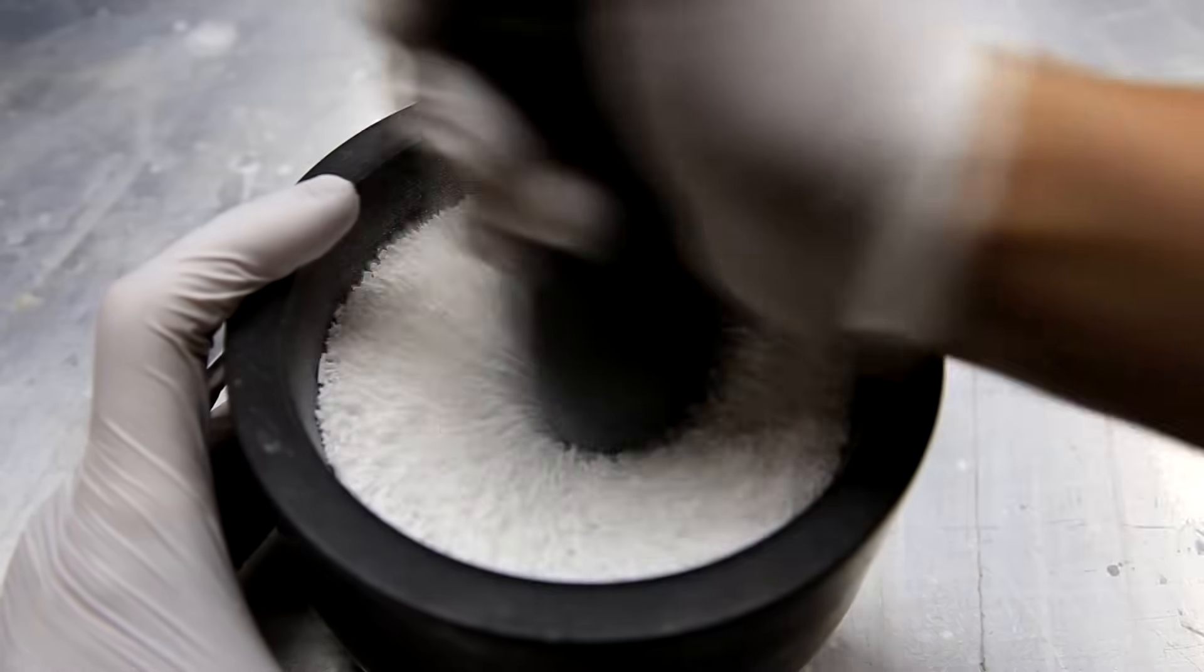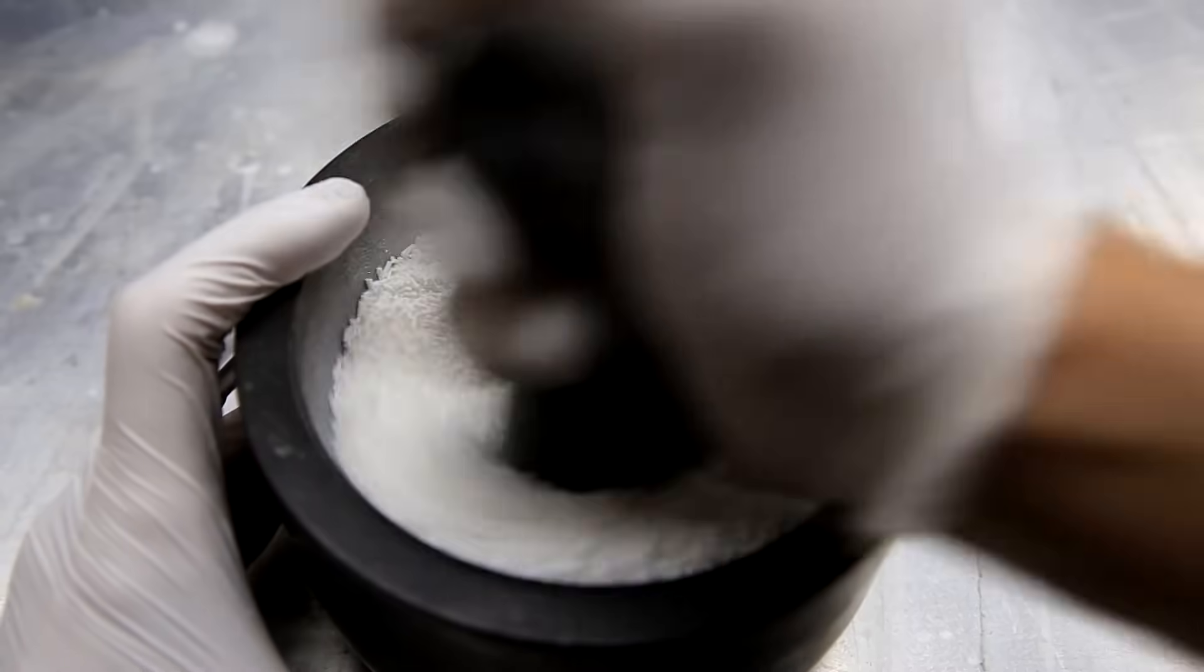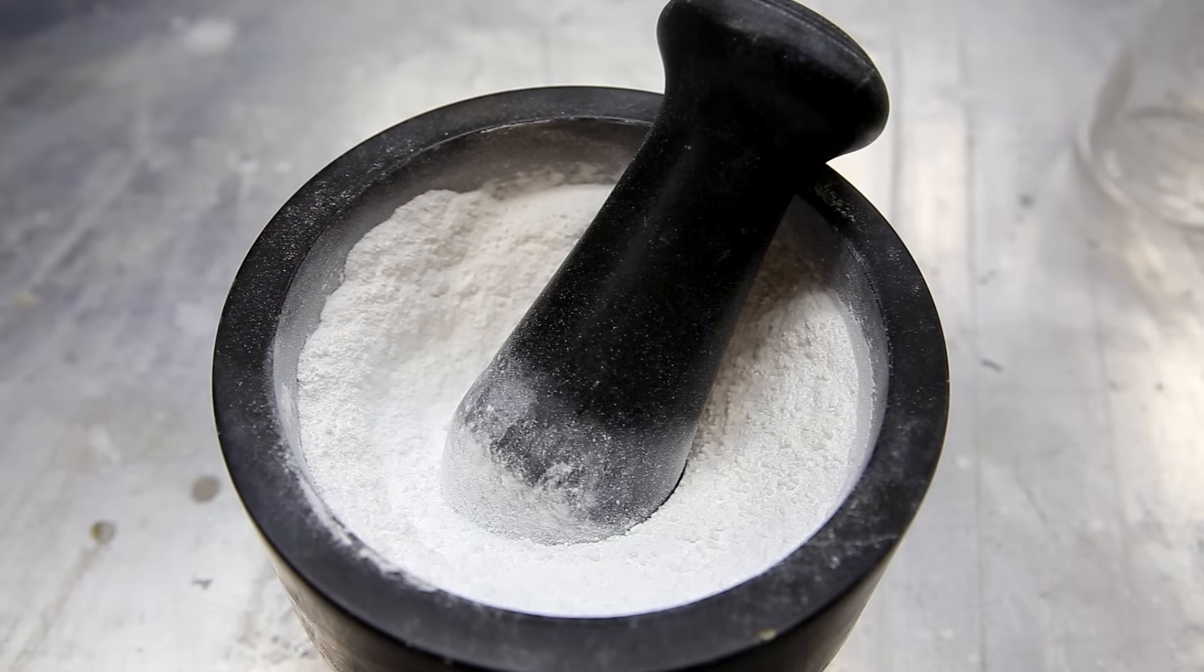Alternatively a coffee grinder could have been used instead of doing it by hand, and the easiest method is to simply buy sodium benzoate in powder form. After enough grinding eventually we're left with the powder.